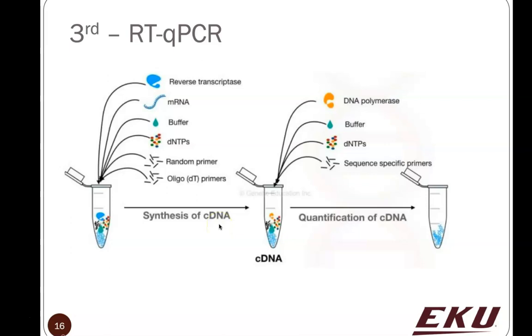And then the complementary DNA is subjected to the usual process that we would do on most things like bacteria or DNA viruses. We then add the DNA polymerase, which, if you remember from biology, helps us make lots of copies. So we make copies of the actual complementary DNA in the solution.